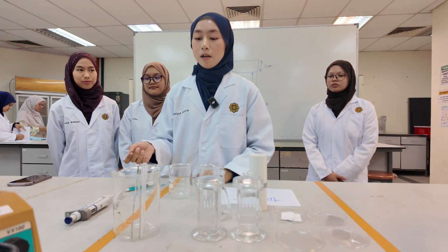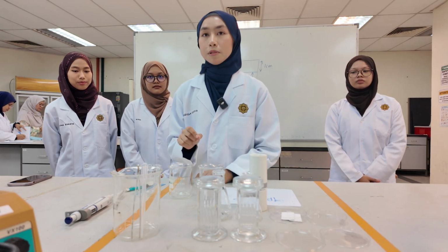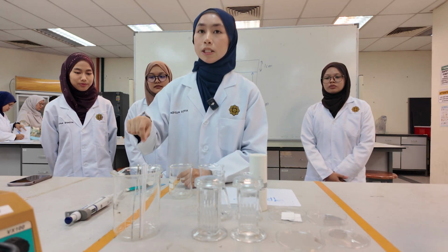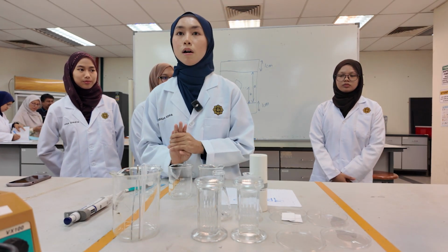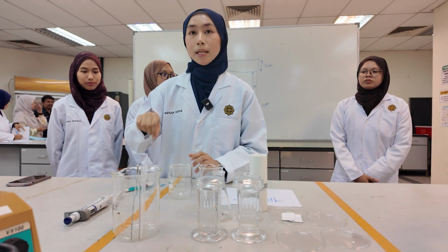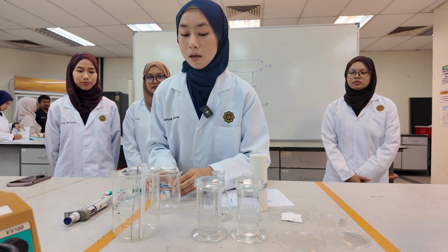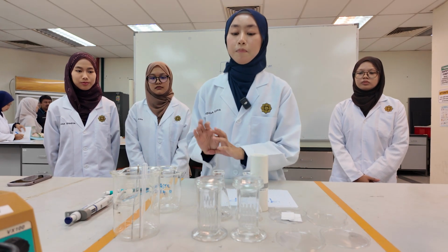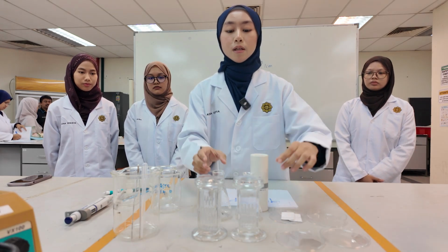Put acid, base, and neutral compound. Then we dissolve each of the compound in 5 ml of dichloromethane. Mix them well and set them aside for the spotting. Next, we prepare our developing solvent.